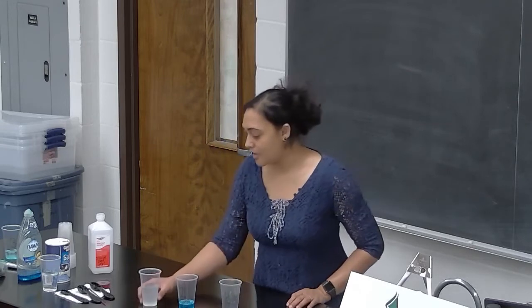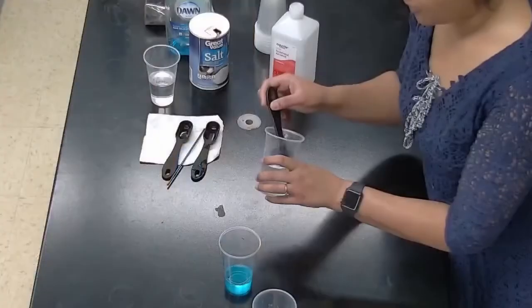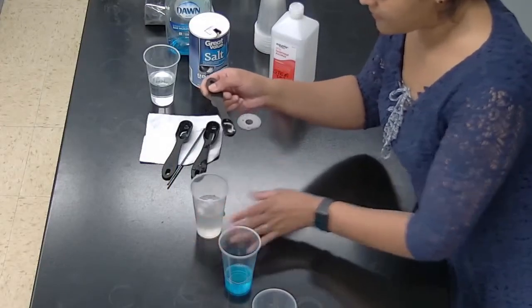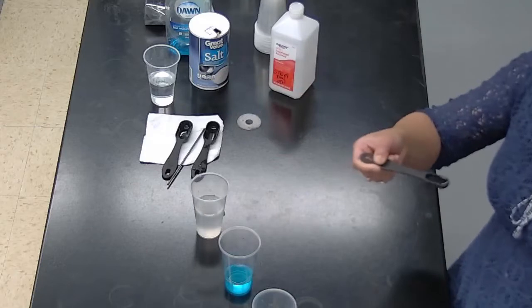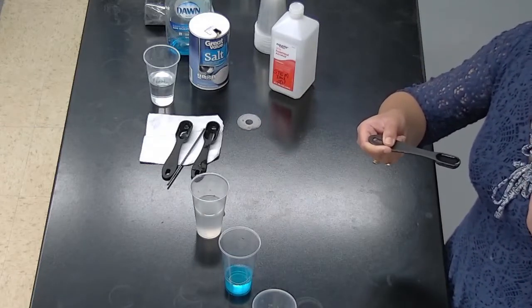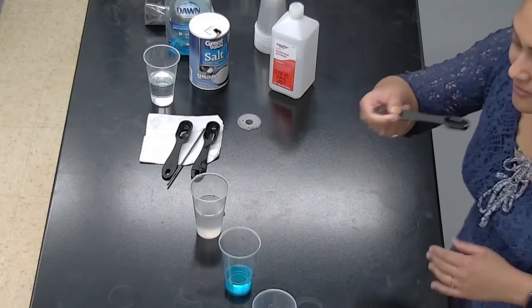So now what I will do is take 1 teaspoon of the salt water that I prepared from the cup and put it in my mouth. I know it's very salty, it will taste horrible, terrible, whatever you can say. You can drink water after that.